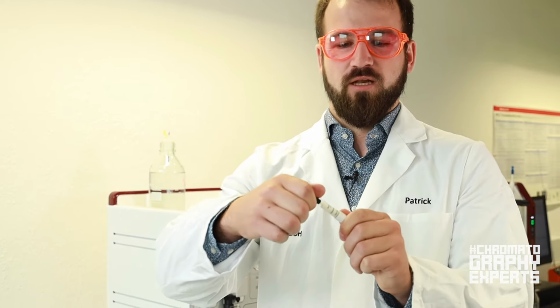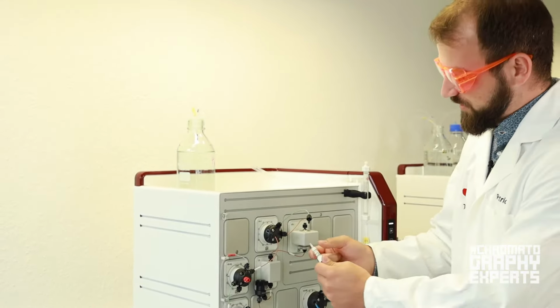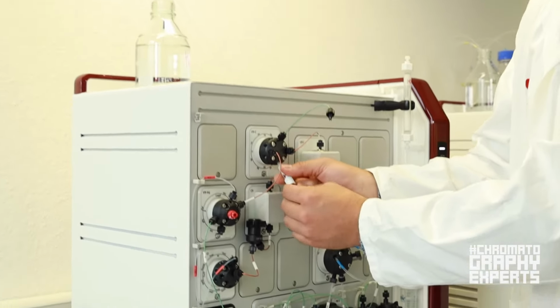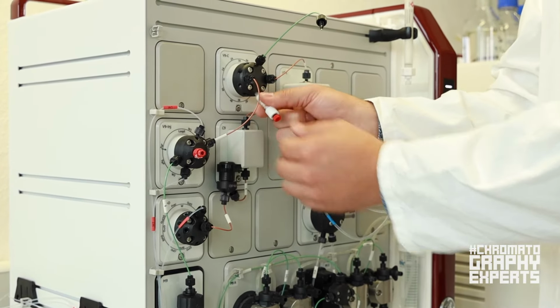Welcome to our lab in Griesheim. Now I will show you how to connect our SkillPak columns to your liquid chromatography system. So we start with a 1 milliliter column, and to connect the column to your system, we first have to remove the lower stop plug. And you can see there is a thread on the lower end of this column, and this thread can directly be used to screw the column into the valve block. So we screw the column into the valve block.